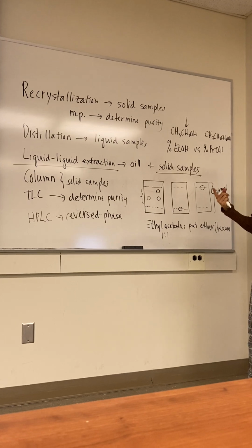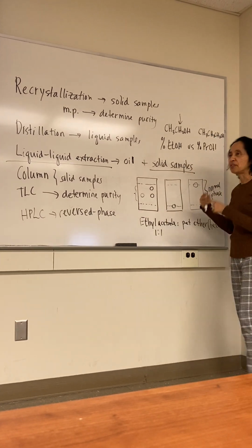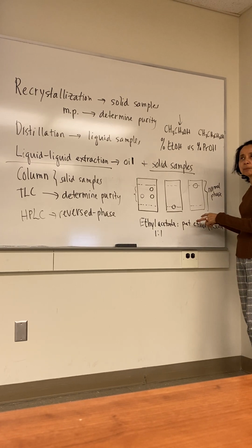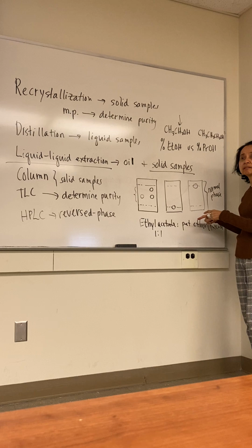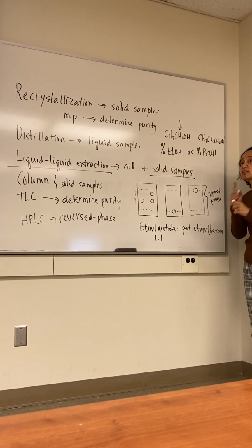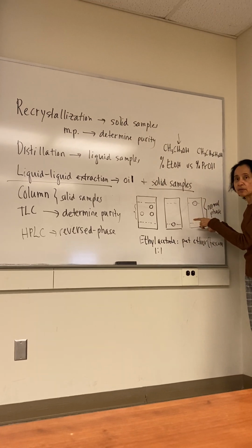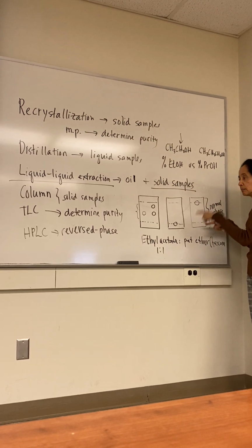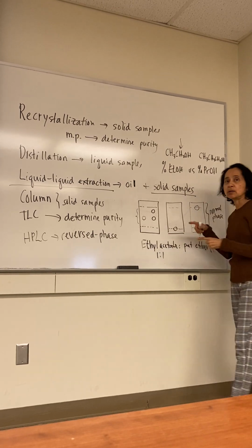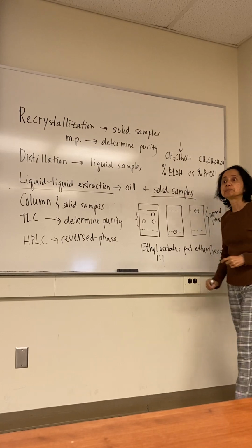It's the opposite. So instead, to make it go faster, you're going to invert. You're going to make the non-polar component higher. It's the opposite, it's the reverse because it's reverse phase chromatography. This is normal phase. So think about normal phase, the polar component is going to be slower, but for this one, the polar component is going to be faster. Okay?